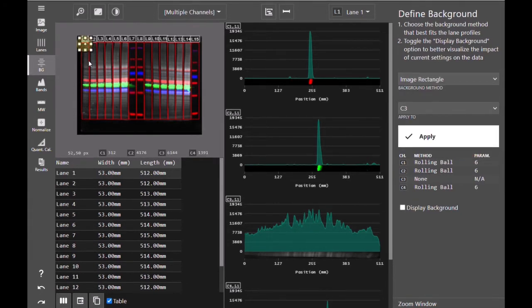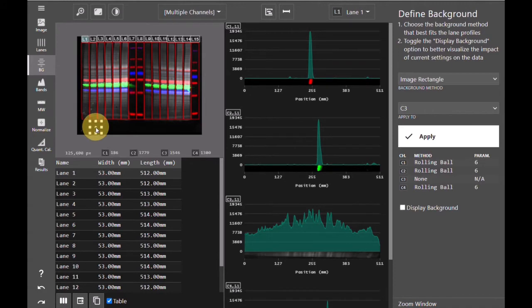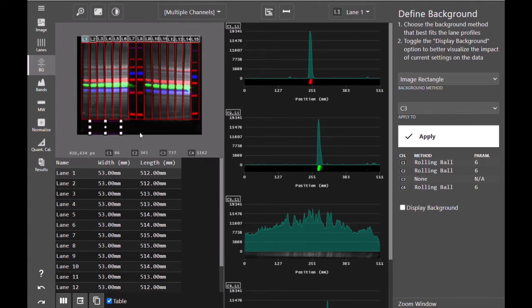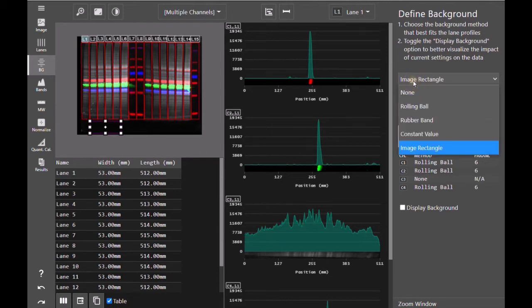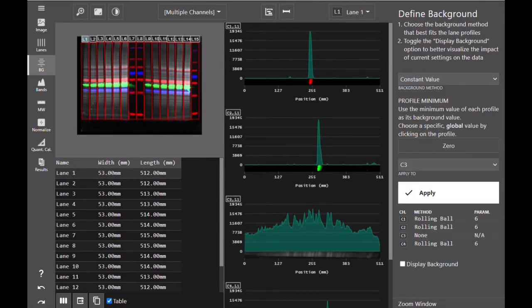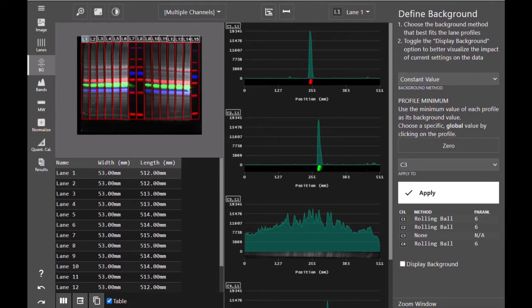Image Rectangle allows you to draw a rectangle on your image and will subtract the signal within that rectangle from your entire blot. Constant Value takes the minimum value in each profile and subtracts that as background from each lane, or you can select a value to subtract globally across the entire blot so that the same value is subtracted from all channels.